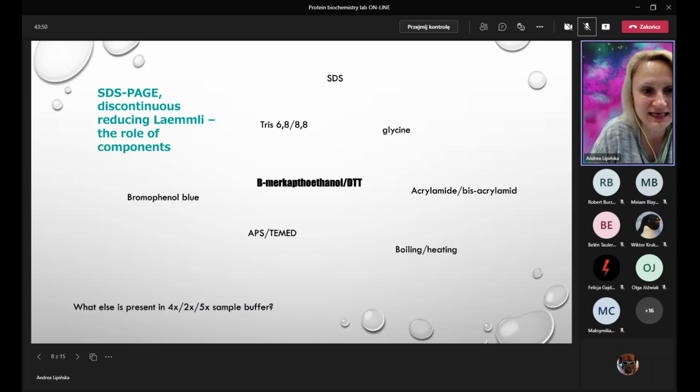Okay, APS and TEMED, so ammonium persulfate and tetramethylethylenediamine. So what's the role of them?